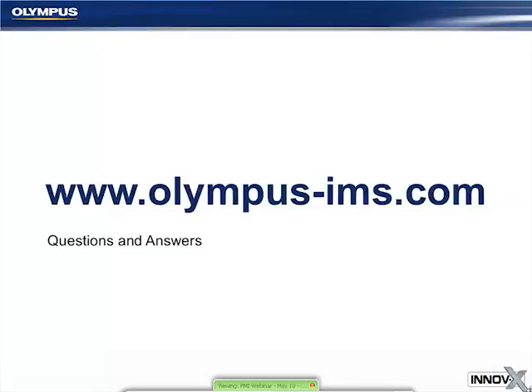Any special license required for radiation? The regulations are different everywhere in the world. Typically, there is no license required because there isn't any radioactive material. Licensing is typically defined as a license for radioactive material. We're using what's called electronic product. We produce our X-rays electronically, but typically registration is required, and that is you do have to notify your regulatory body, and they usually want you to send them a check for $50 to $500 depending where it is.